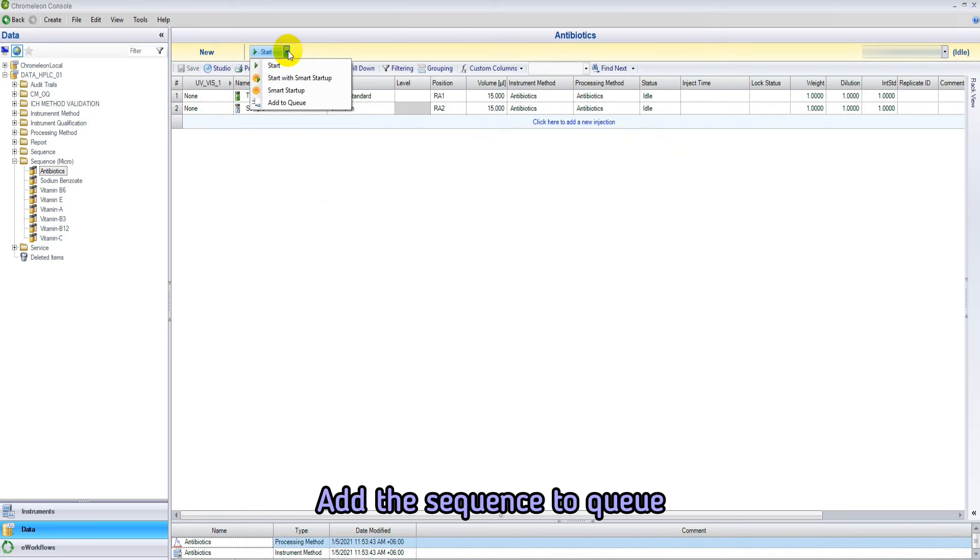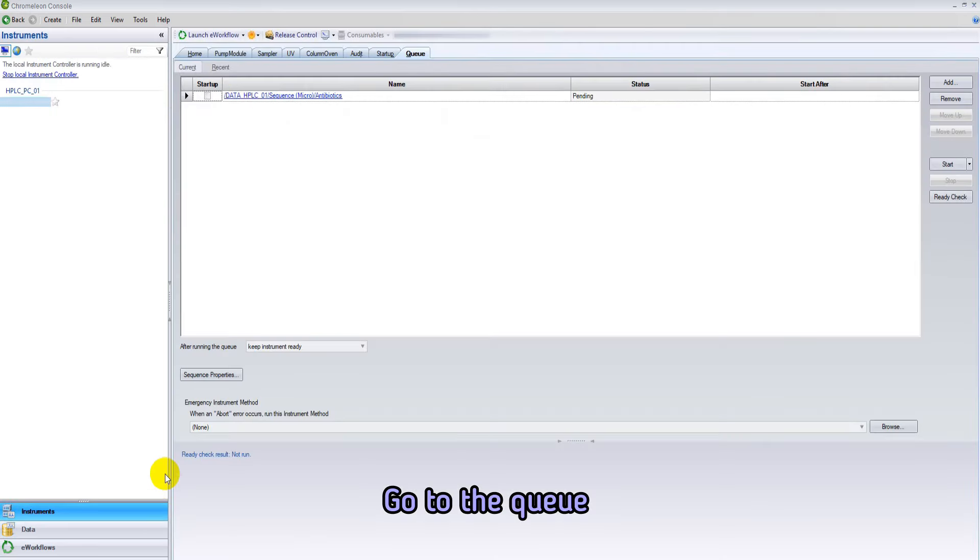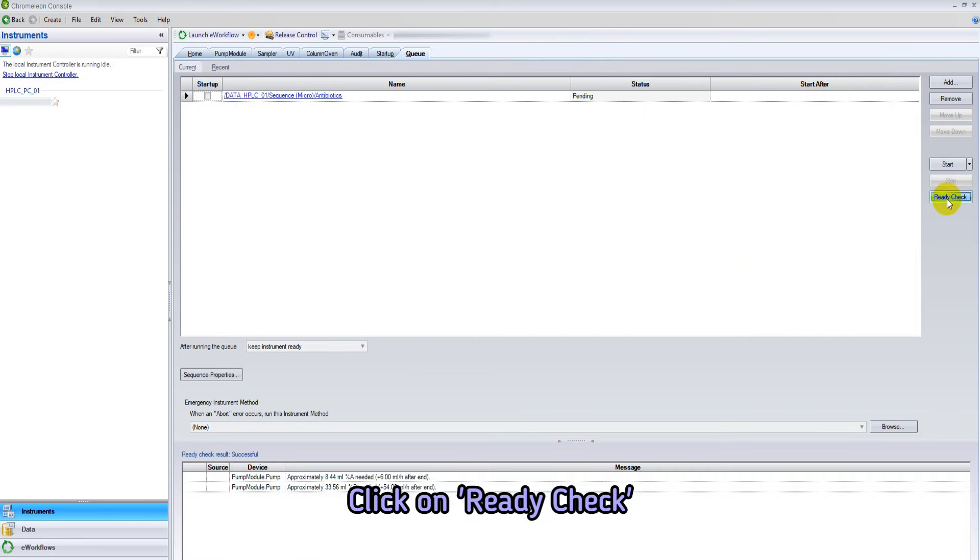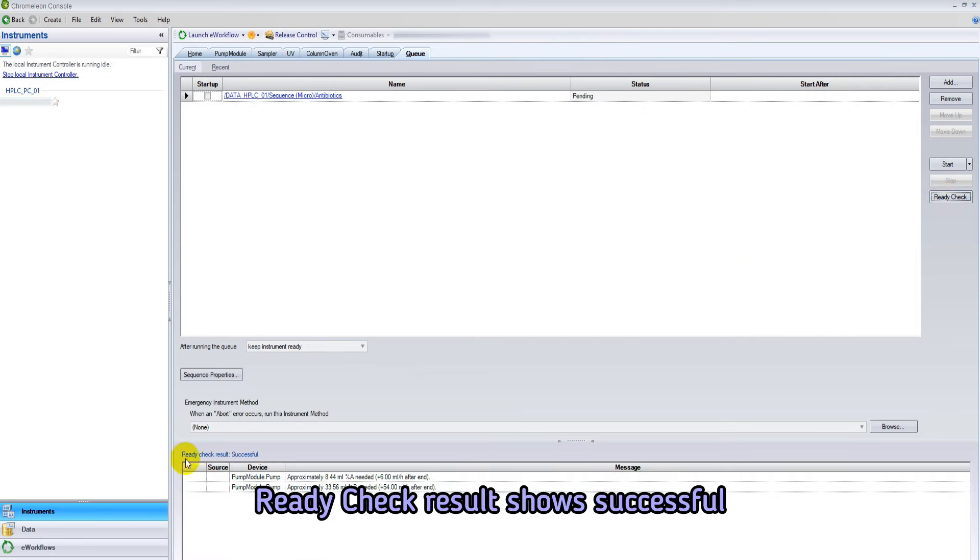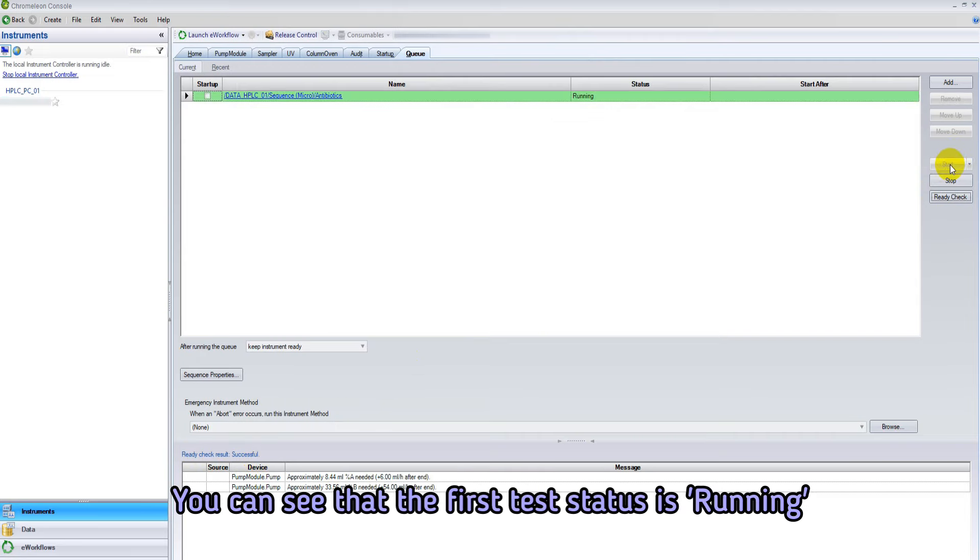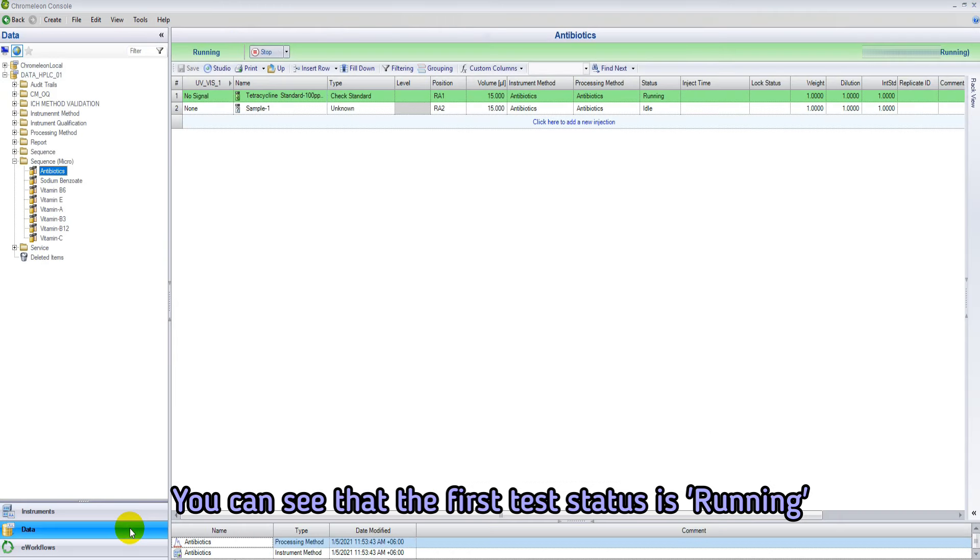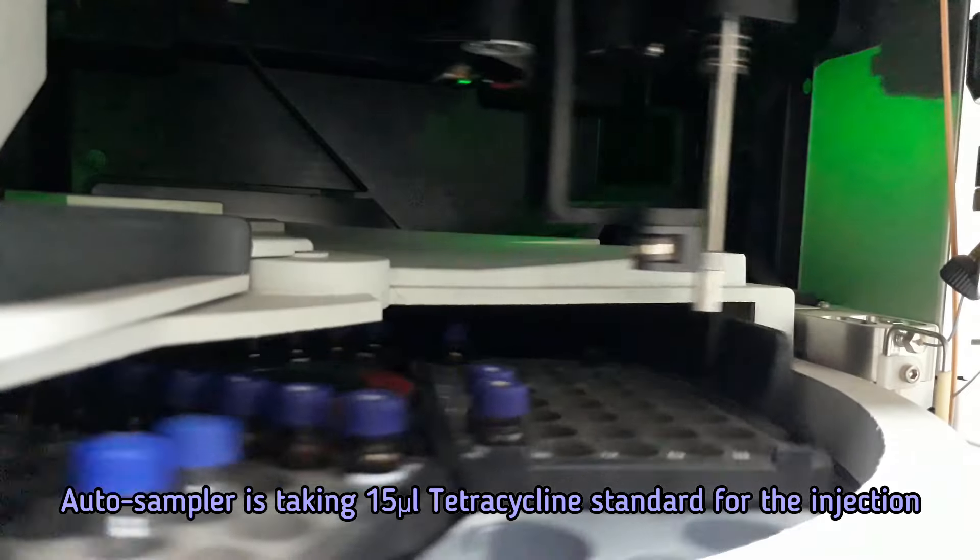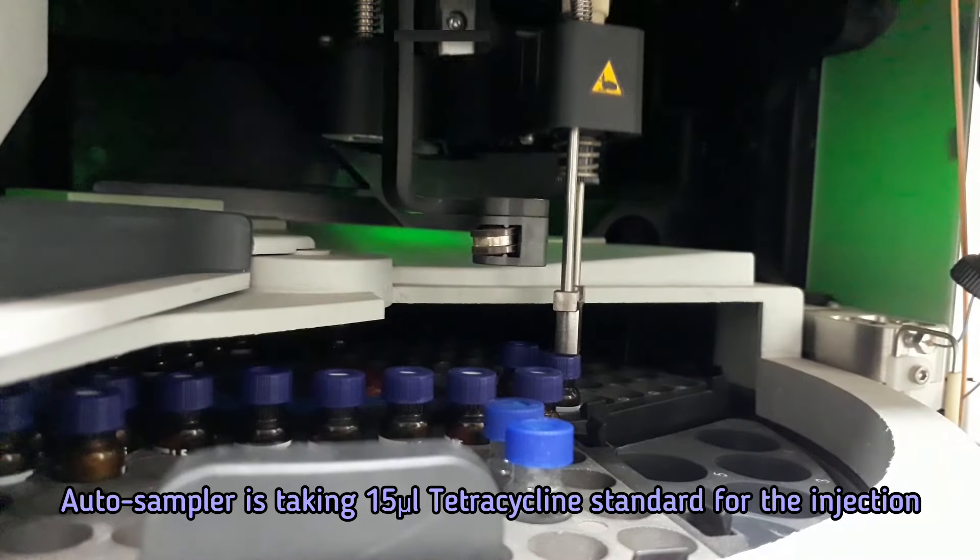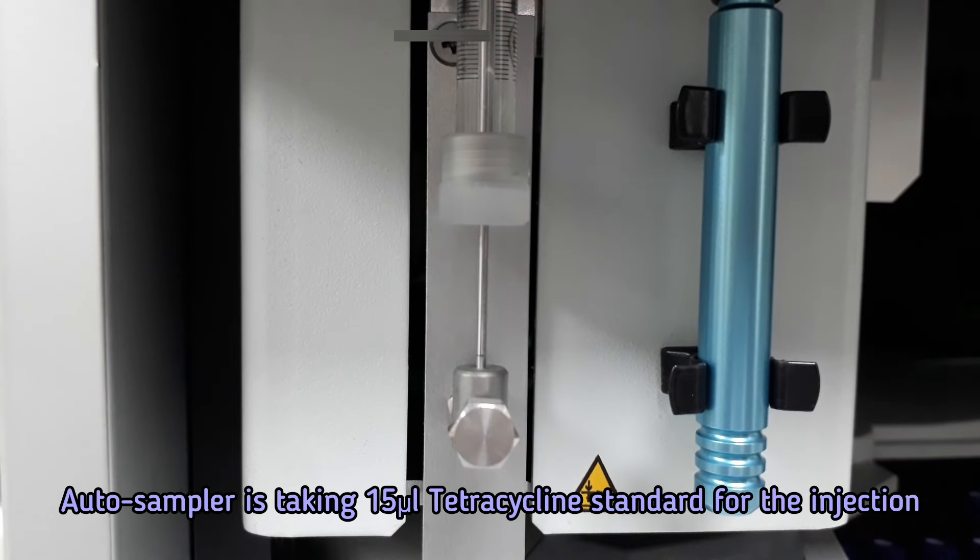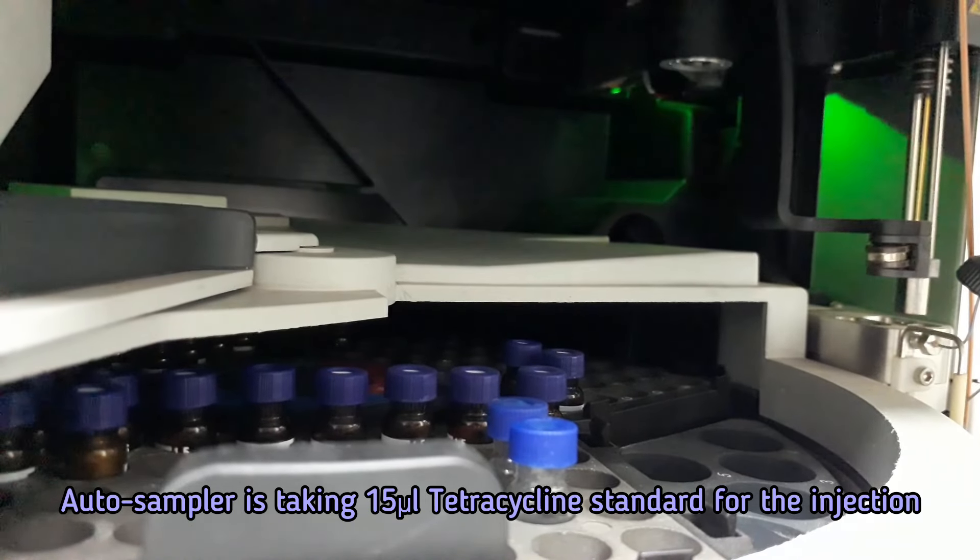Add the sequence to queue. Go to the queue and click on ready check. If the ready check result shows successful, then click on start to start the instrumental analysis of tetracycline antibiotic residue. You can see first test status is running.